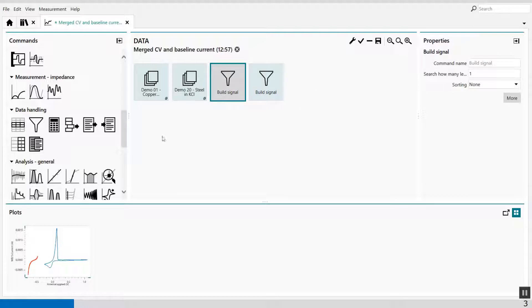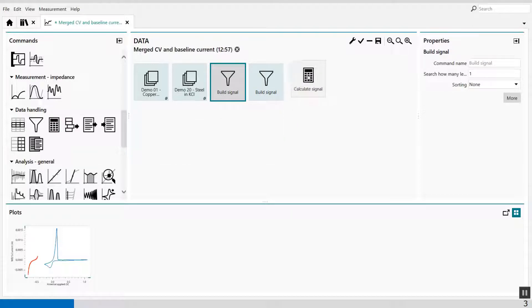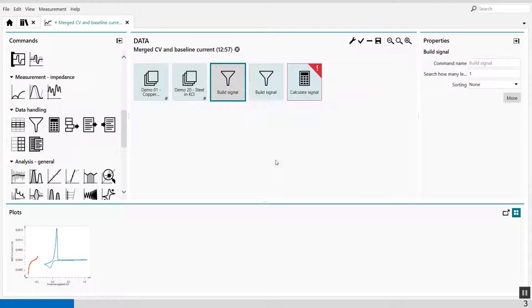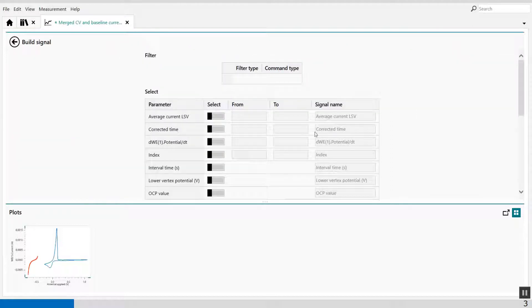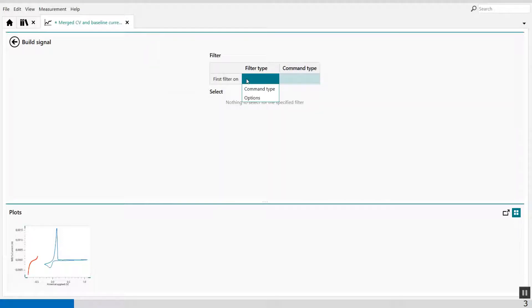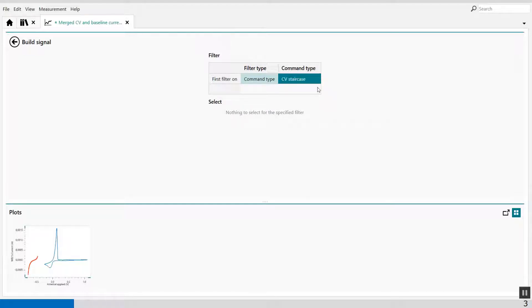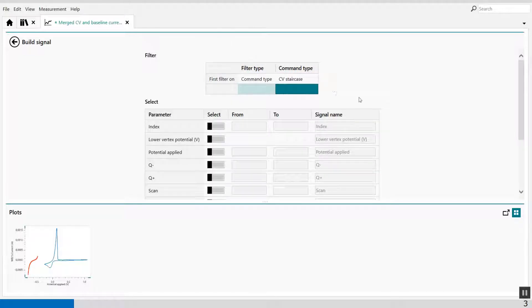And I have to use a calculator afterwards, because I'm going to subtract the average current from the LSV from the CV current. First, I'm going to extract the values. Well, select the build signal command. Command type. I want to extract the current from the CV.